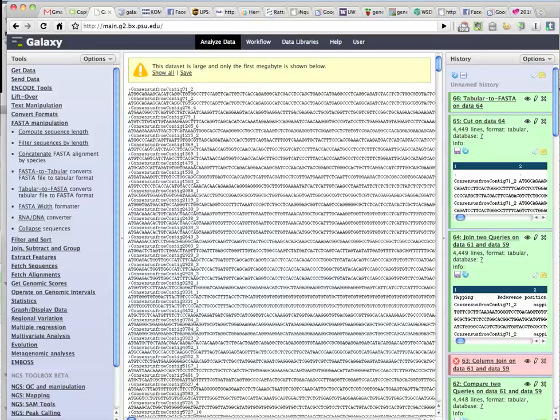Then with a simple FASTA manipulation, going from tabular to FASTA, picking the correct columns, we get a FASTA only the ones that are positive, and now we can easily annotate these. So we see where sequences are, which non-synonymous SNPs, what the functional genes are.